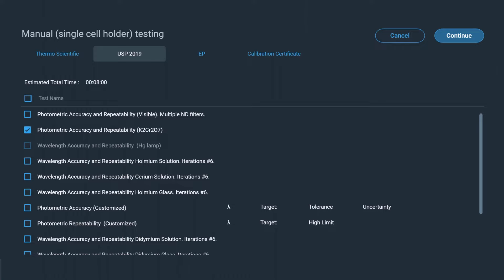Performance verification tests, such as wavelength accuracy and resolution, are included in the software. Specific tests to ensure USP and EP compliance are available, as well as tests specific to JP for the Evolution Pro.